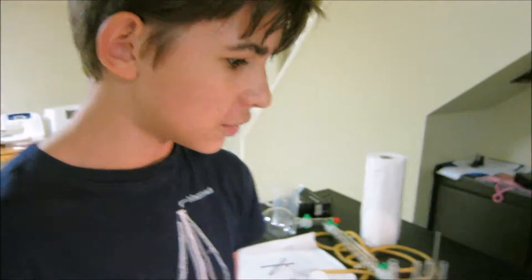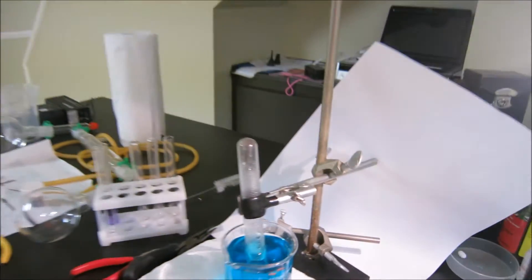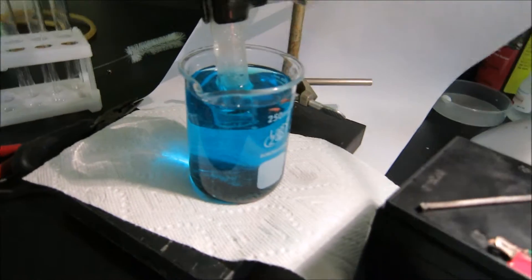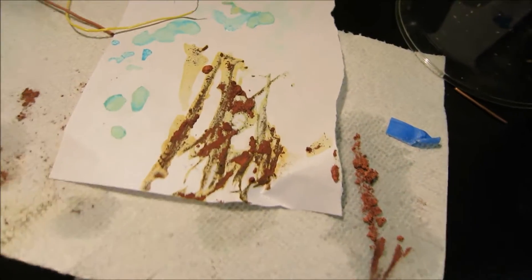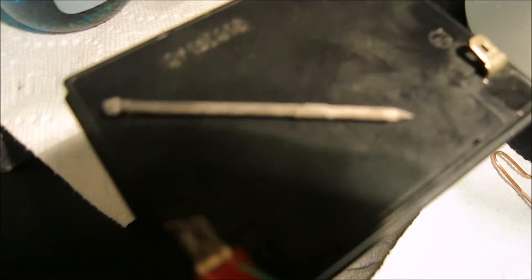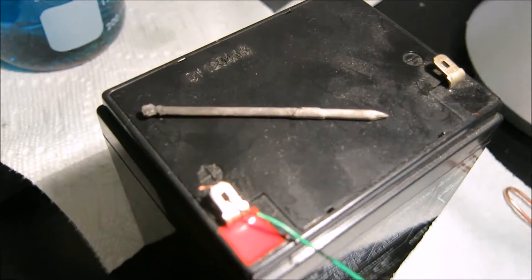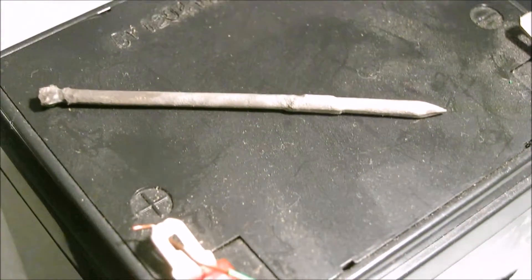We stopped the reaction because the nail dropped off from the wire. We have an almost full tube of gas, which is supposed to be oxygen. We have gathered quite a lot of copper, and finally we cleaned off the nail. As you can see, it has partially dissolved in some places, making quite an interesting shape.